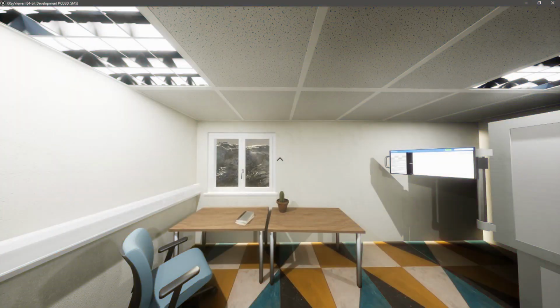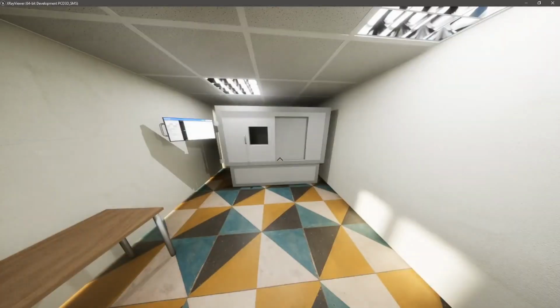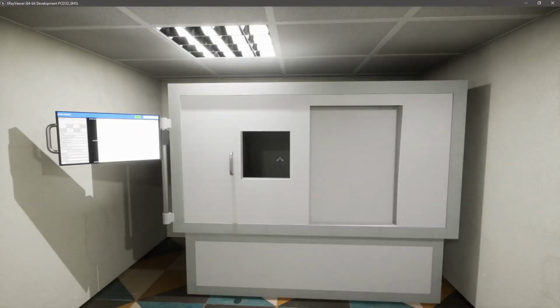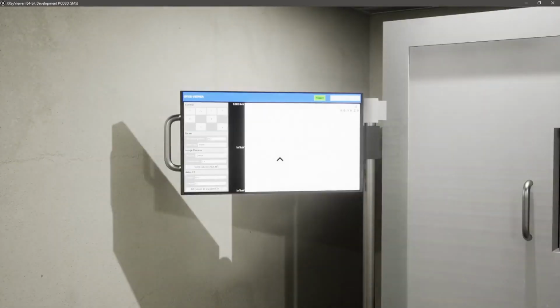Okay, this is going to be a quick overview of the X-ray viewer application that is working with the gVXR library written by Frank Vidal. To start with, there's a 3D environment. If I put the field of view to the correct field of view, as we can see, there's a LabCT scanner with an appropriate interface for doing CT scans and setting up sample positions and all sorts. I'll go over that in a minute.